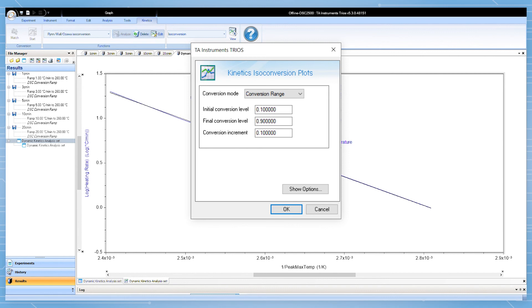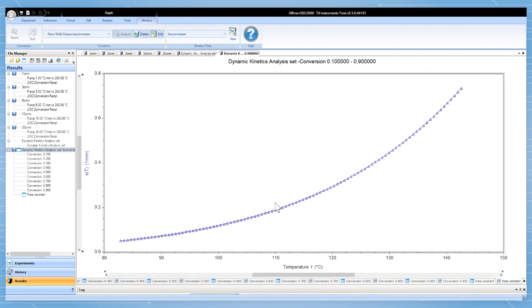Select a single conversion or temperature or select a range from the drop-down. Specify the range and the increment and click OK. A series of graphs will be generated.